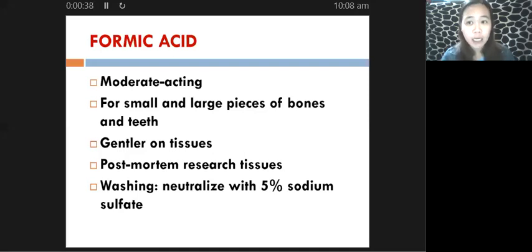I will also be discussing other methods that you can perform in the laboratory to remove your calcium or your mineral deposits. At the end of this video, I will also be talking about our post-decalcification treatment, and of course, the different tests which we can perform in order to determine if the decalcification process is already complete. So let's start with our formic acid.